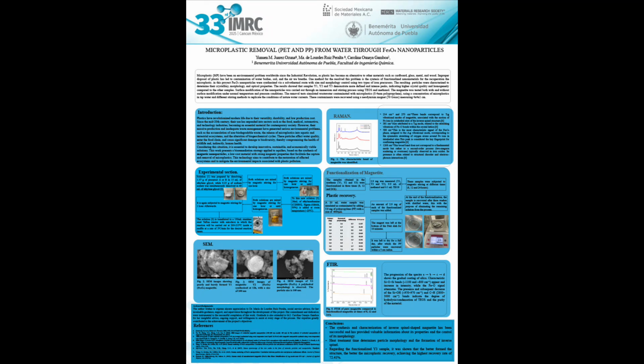588 cm⁻¹. This is the most characteristic signal of the Fe₃O₄ phase, assigned to the A1g vibrational mode, corresponding to the symmetric stretching of oxygen atoms around Fe ions in tetrahedral sites. This peak is considered the key fingerprint for confirming magnetite.